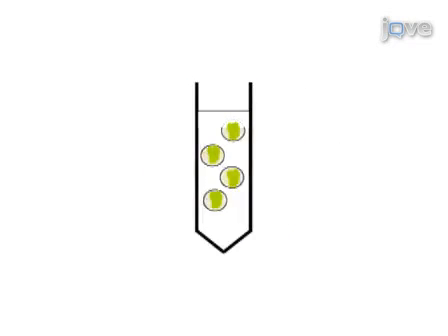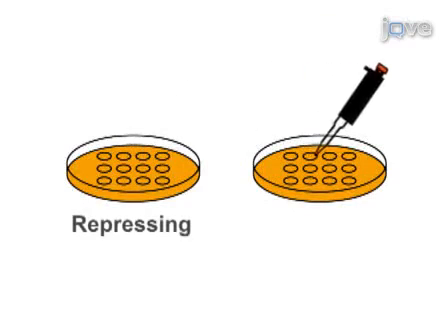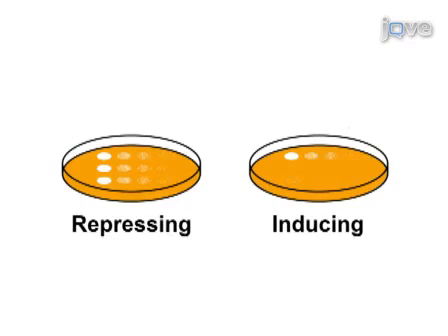Induced cells are lysed for subsequent Western blot analysis to verify expression of the effector. After confirming expression of the effector, cells are grown, and tenfold serial dilutions are spotted onto repressing and inducing media. Finally, after 2 to 3 days, yeast growth is analyzed.